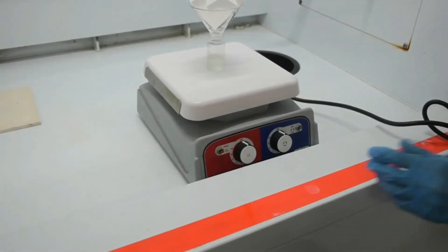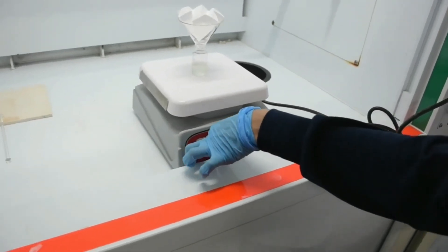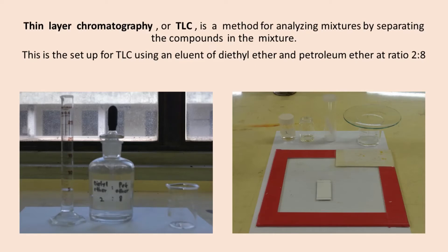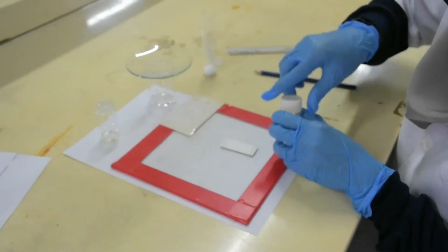Evaporate off the solvent using a hot plate. Thin layer chromatography is a method for analyzing mixtures by separating the compounds. This is the setup for TLC using an eluent of diethyl ether and petroleum ether at a ratio of 2 to 8. Using a spotter, spot the solution on the TLC plate.